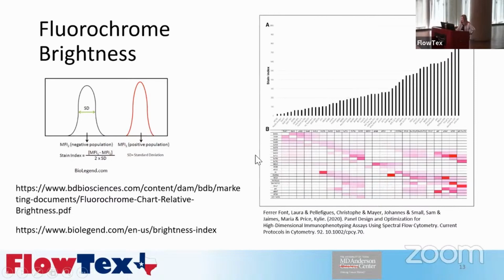And what you're going to be able to do if you use this and you bought antibodies in every color, I'm sorry, if you bought anti-CD4, for instance, in every color, you could make a comparison of the dyes. And this is an example of, I don't know, 50 or so dyes, from those that are least bright to those that are most bright. You can do this on your instrument, and you should. That'll give you the ability to generate a spillover spread matrix, which you can actually use to characterize your specific instrument. And there's a paper here that can give you some more information on that.